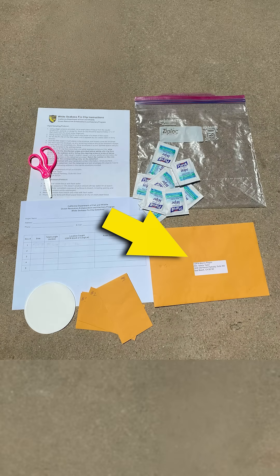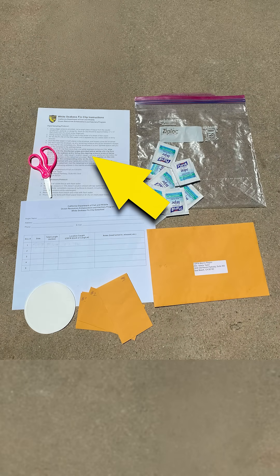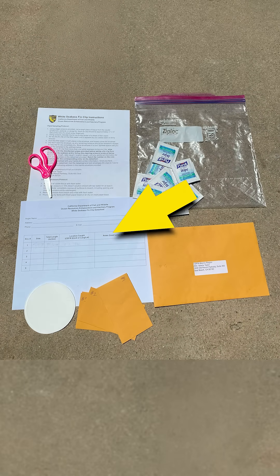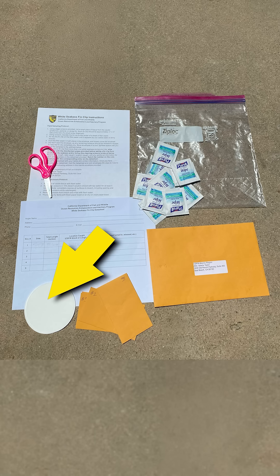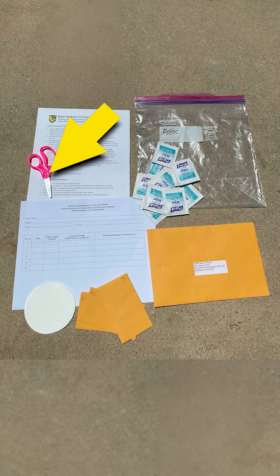Your fin clip kit will include a mailing envelope, instructions, a data sheet to collect any data that you have, wet wipes to clean your scissors with, filter paper, and coin envelopes that are used for the white sea bass fin clip, as well as a set of scissors.